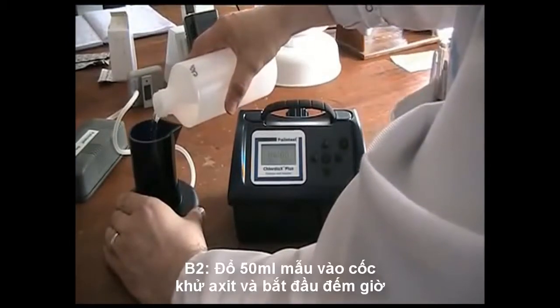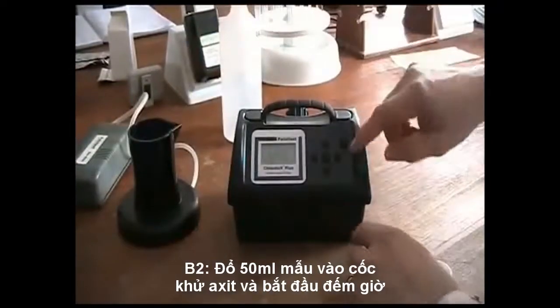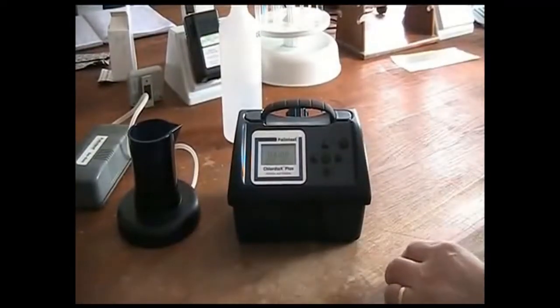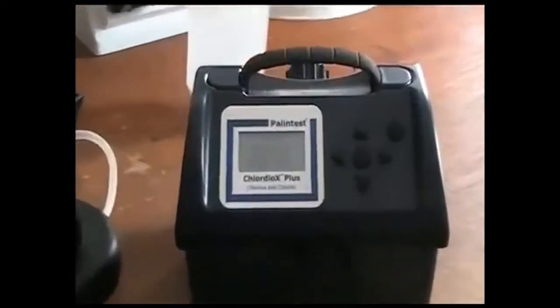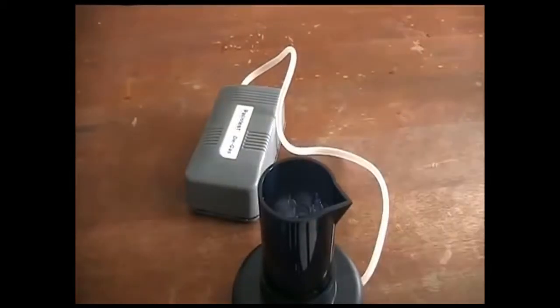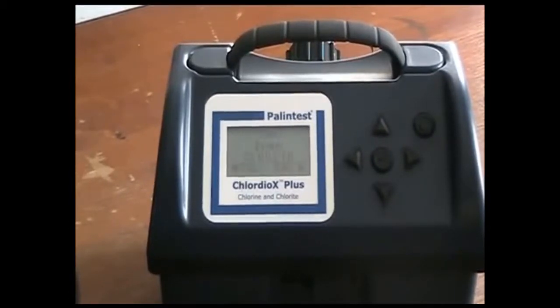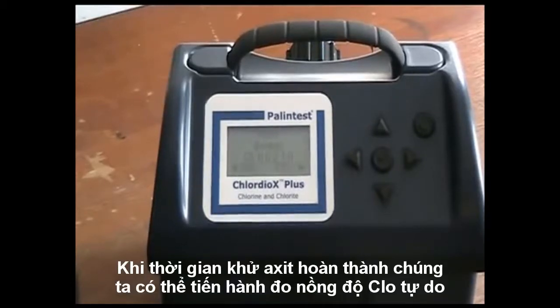Place 50ml of the same sample in the degasser and switch on the pump. Press the right arrow to start the countdown. When the time for degas is complete, you can now measure free chlorine or step onto the chlorite method.